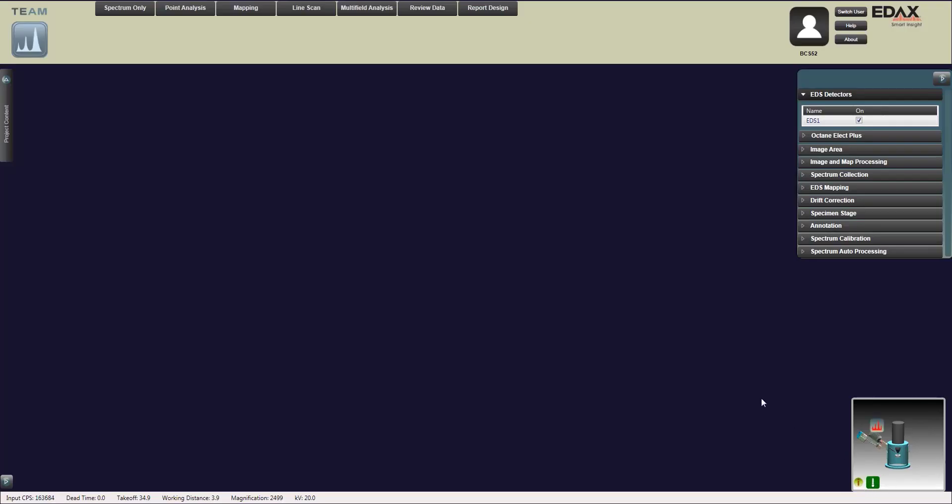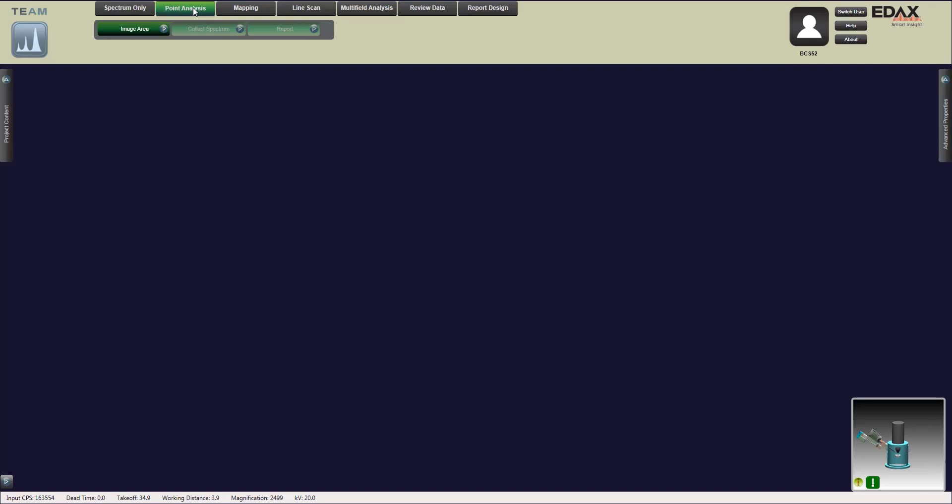Alright, this is the SOP for EDS instruction on the FEI SEM. We're coming straight from doing imaging on the SEM of our TIN sample. We're going to go over to point analysis and import the picture of where we're going to do our EDS analysis.